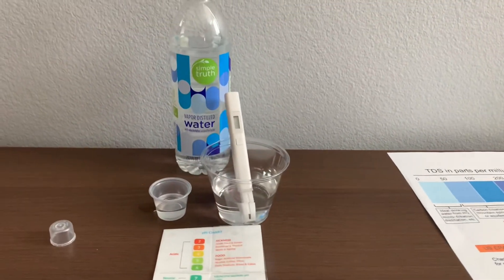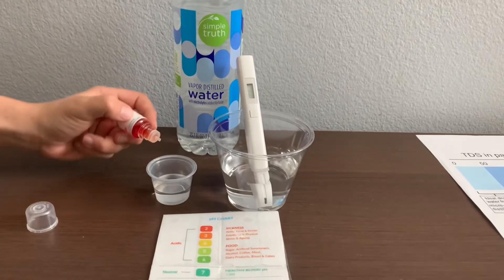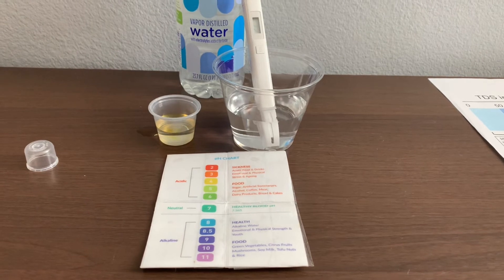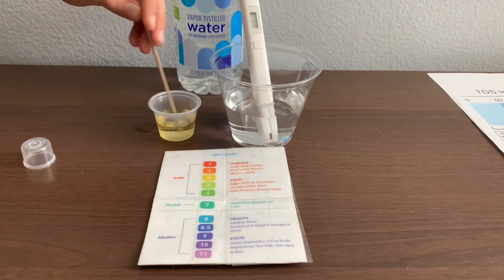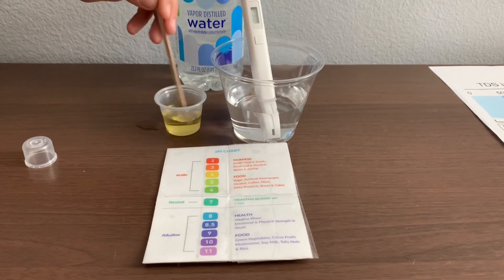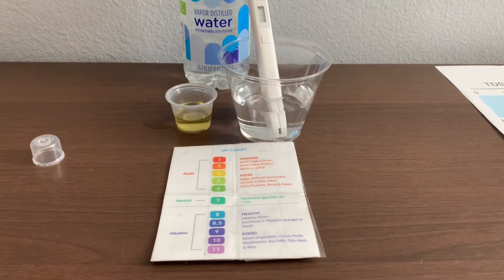Now let's test the pH level — only do two drops. Let's stir it a little for a better result. I give this a 4.